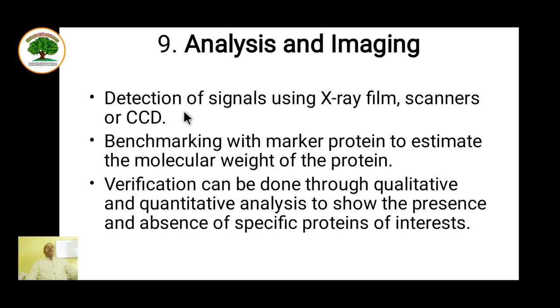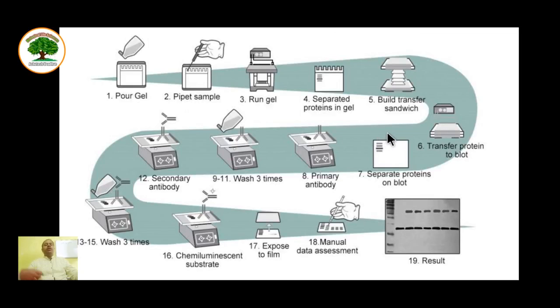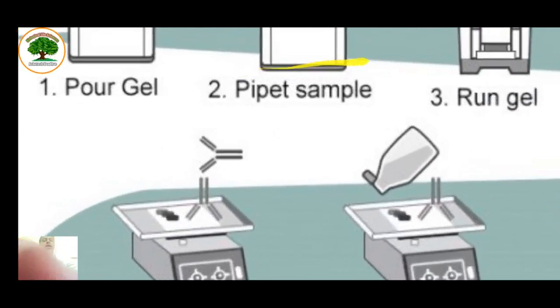Analysis and imaging. If you are using radioactive detection, that is, the primary antibody is a radioactive one, then it can be detected using X-ray film, a scanner, or a CCD machine. Benchmarking with marker proteins to estimate the molecular weight of the protein is also done in this case. And verification can be done through qualitative and quantitative analysis to show the presence and absence of specific proteins of interest. This is the method of Western blotting in short, at a glance.